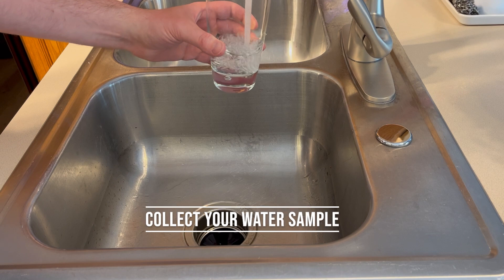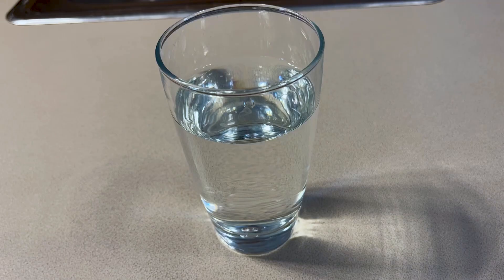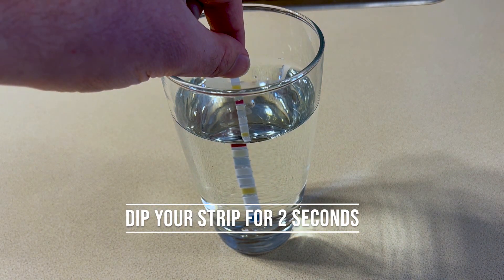The first step is to collect a water sample that is deep enough to dip one of our test strips into. Then you'll take one strip and dip it into your water for just two seconds, then quickly remove it.